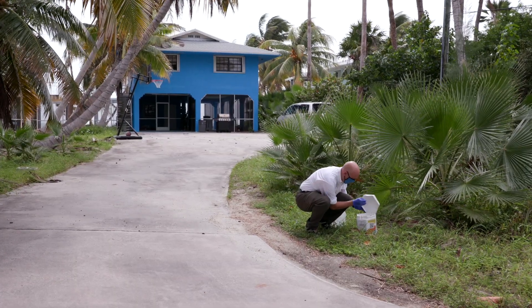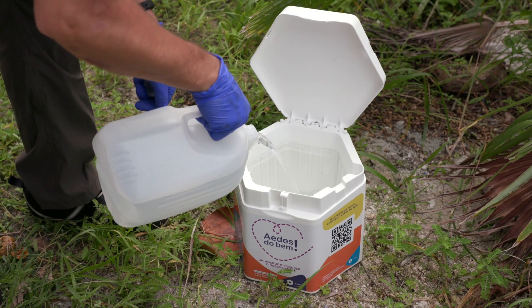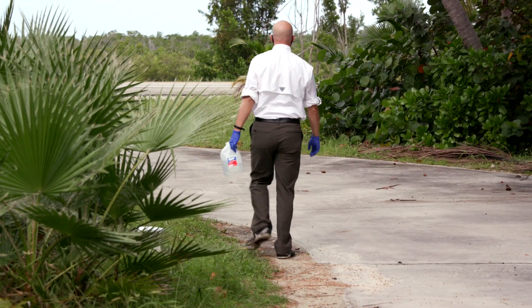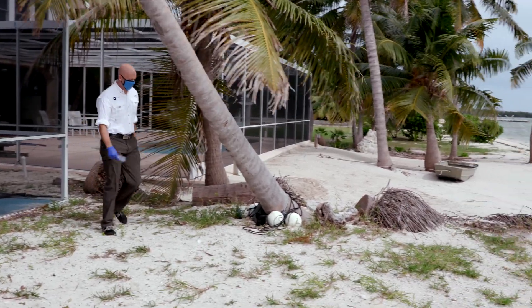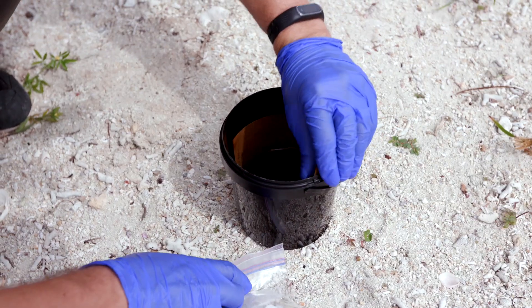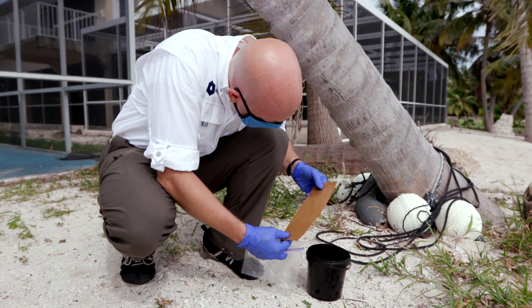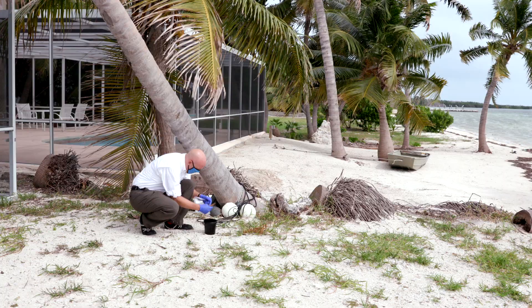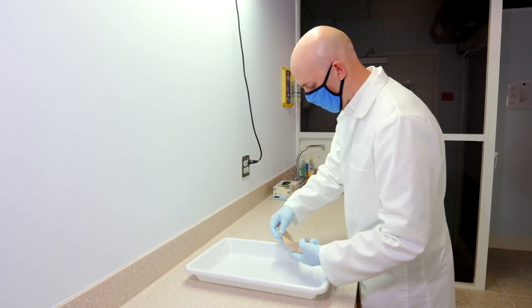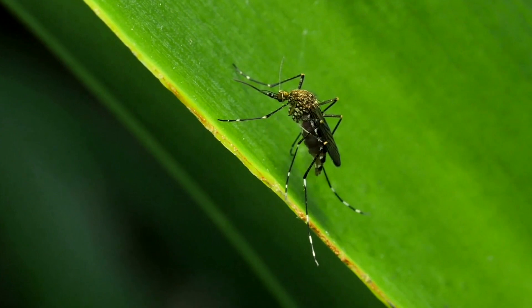Oxitec's non-biting male mosquitoes will start to emerge from the box after about a week. An operator will then visit the box periodically to switch out disposable liners and ensure everything is working well. We will also have community volunteers who host traps like this one which catch mosquito eggs and adult mosquitoes. These traps will be visited weekly to collect the captured insects. Catches from traps in the field will be evaluated in this lab, including looking for the fluorescent marker that distinguishes our mosquitoes from the invasive mosquitoes already in the Keys.